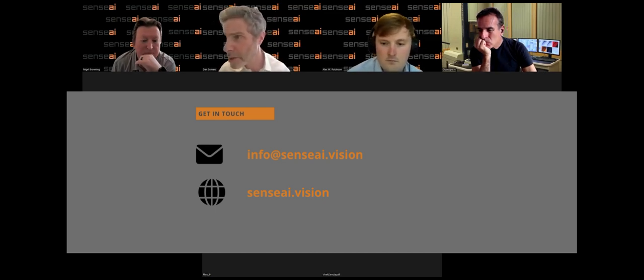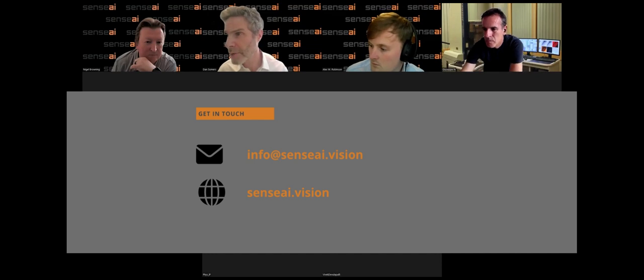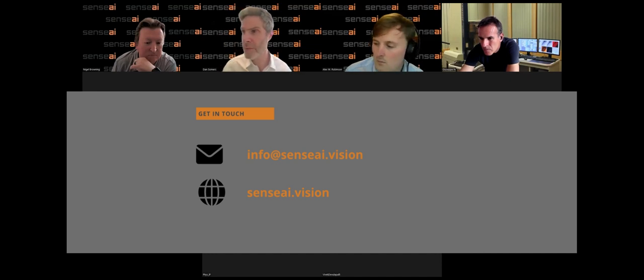And then there's one for Nigel right from the beginning: how can this technique enhance the accuracy in quantitative EDX maps with inherently low amount of information? When quantification is done using the Cliff-Lorimer method, the error will be greater than 10% for the signal to noise that we have.